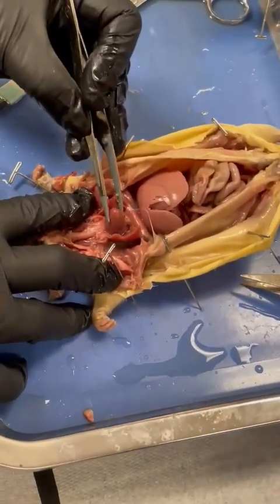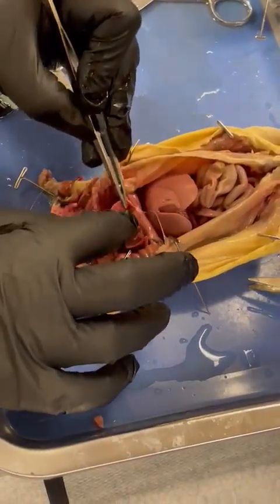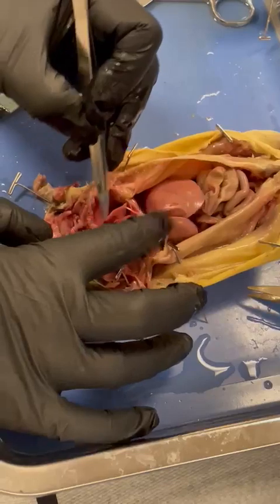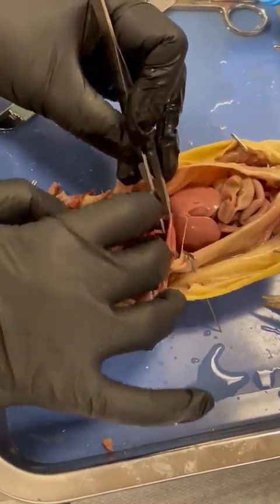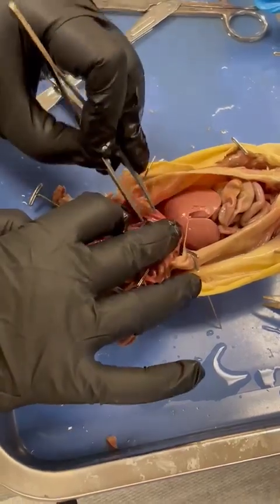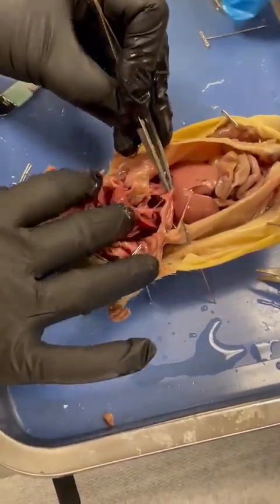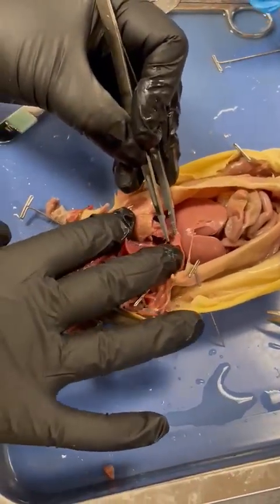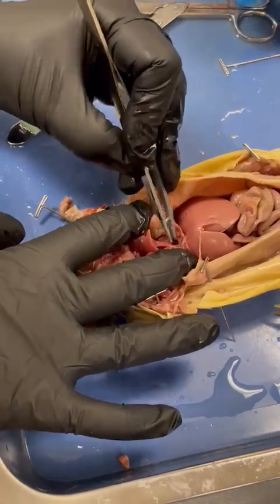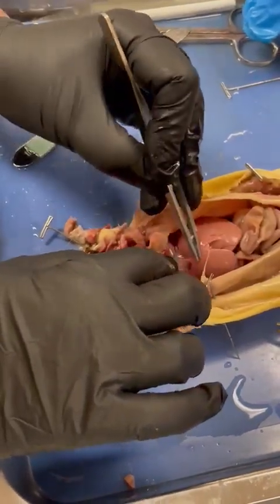This is the heart. The esophagus goes below the heart, as does the aorta. This is the diaphragm that separates the thoracic cavity from the abdominal cavity. You can see the esophagus and the aorta, the thin tube, going through the diaphragm.